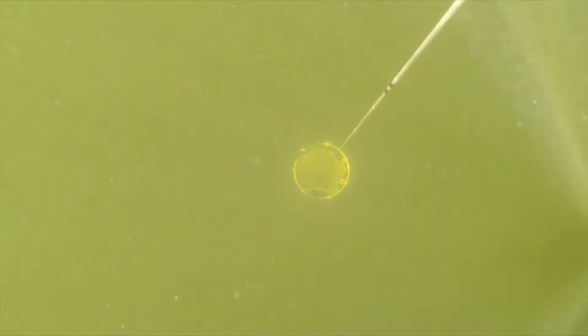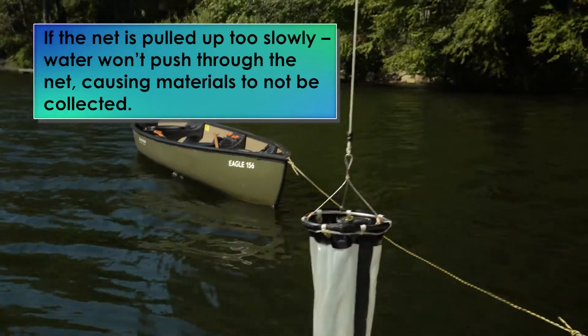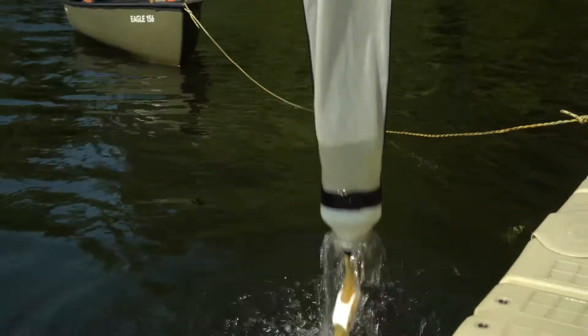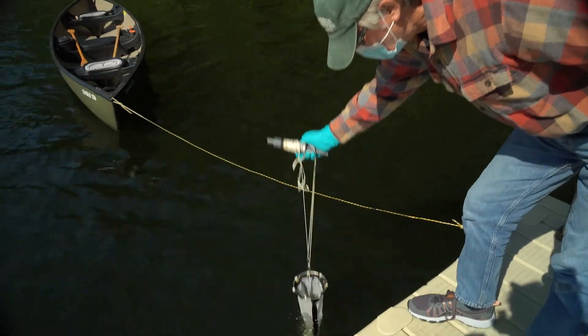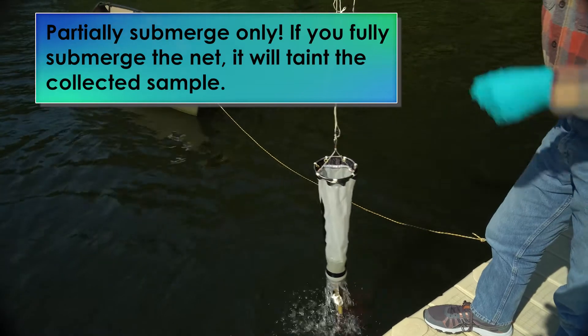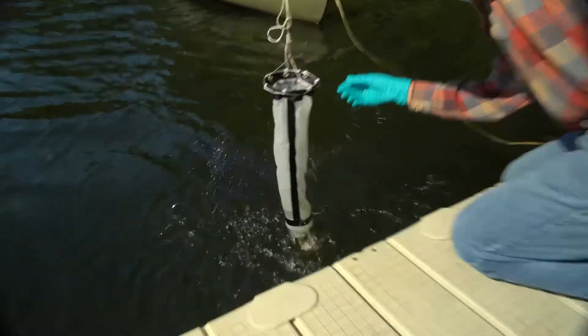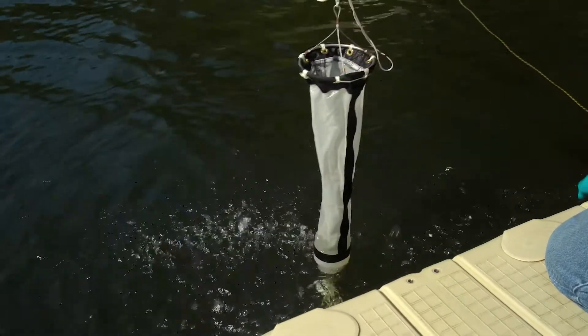Slowly pull the net up at a rate of approximately one foot per second. With the net out of the water, you may find materials have attached to the side of the net. Partially submerge the net repeatedly in the water to rinse all the materials into the bottom. If there is additional material on the outside of the net, you can use your gloved hand to splash water against the outside of the net to clean it.